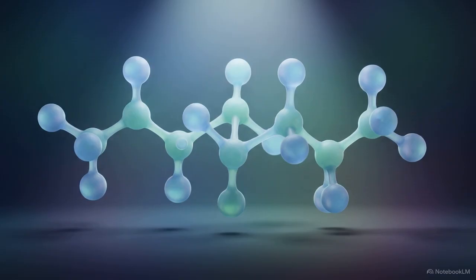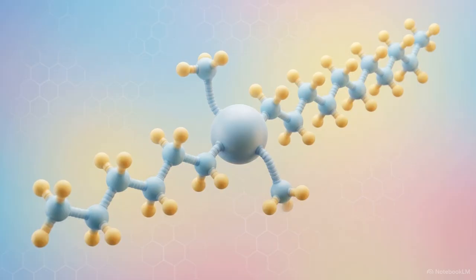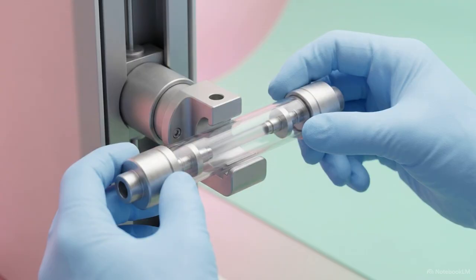For most reversed phase chromatography, the industry standard starting point is the C18 column, but chemical nuances dictate that two C18 columns can behave completely differently, leaving analytical chemists to figure out which specific type fits their exact method. The most common configuration is the ODS column, which stands for octadecylsilane. It serves as the primary workhorse for general-purpose analysis.